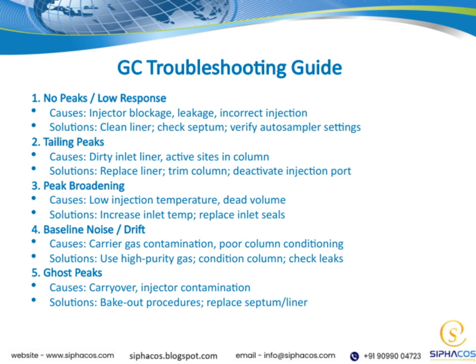To address this, increase the inlet temperature to improve vaporization and replace inlet seals if they're contributing to dead volume. These adjustments help sharpen the peaks and improve resolution.